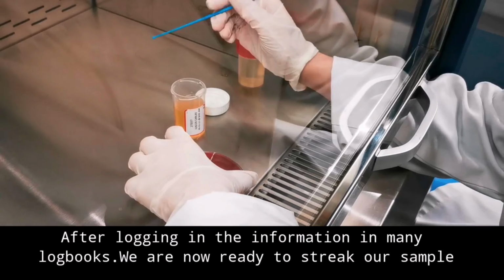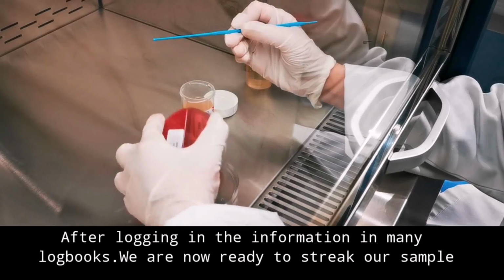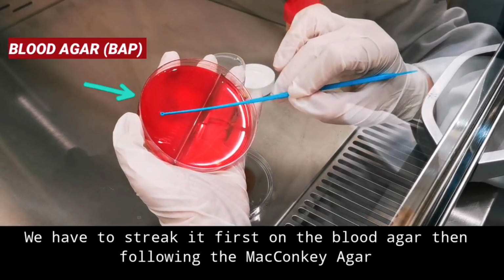After logging in the information in many logbooks, we are now ready to streak our sample. We have to streak it first on the blood agar, then following the MacConkey agar.